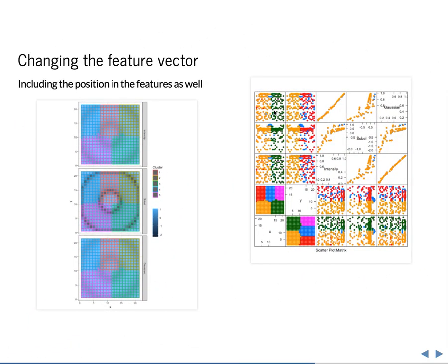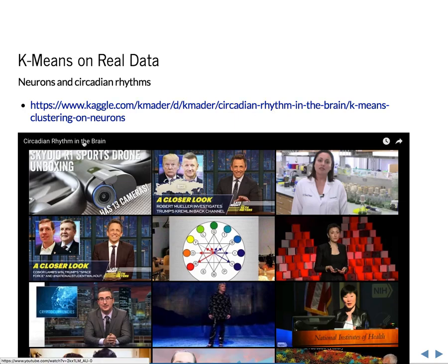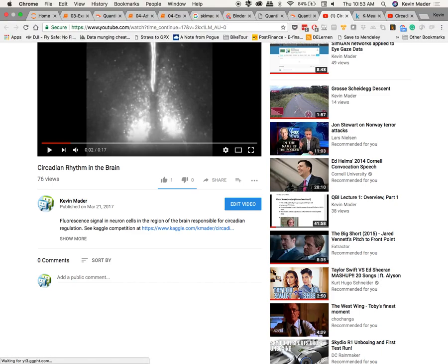But anyways, it's not particularly obvious what exactly those would be. If you're looking here, these points are obviously fairly easy to identify as a neuron, but all of these here are blurred together. So trying to come up with individual neurons from that image wouldn't be particularly easy.